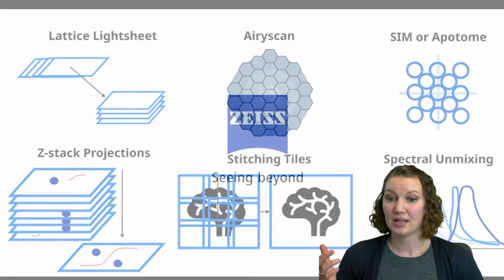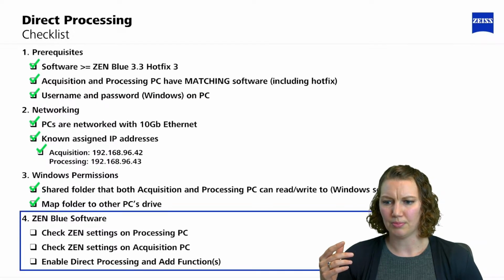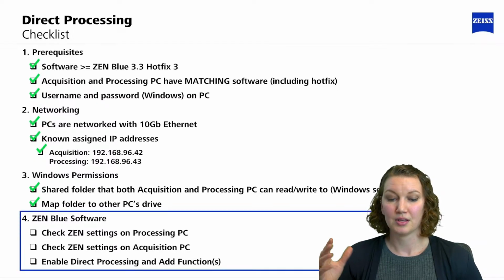How you actually set it up on the back end, I'm adding some of these to the portal. Give me 1 sec so I can pause this.